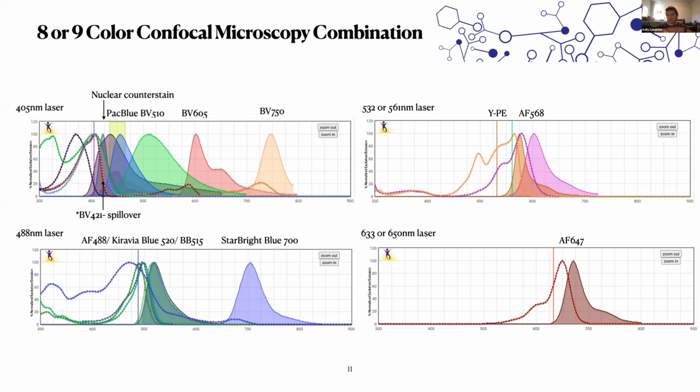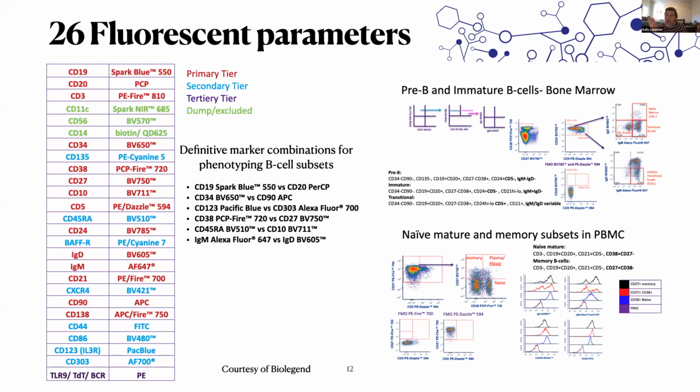So this is an application that I did right away. Not new to microscopists, but new to flow cytometry, we have now entered the age of spectral detection in flow cytometry. And it's amazing. I never thought you could do it, just to be able to control the rate of the cell in order to collect enough photons to be able to unmix. We know what it's like on a spectral confocal, making sure that you have enough time that when you have two overlapping fluorophores, you collect enough of each of their photons within that scanning time in order to accurately unmix them. It's one of the fundamentals of spectral confocal.